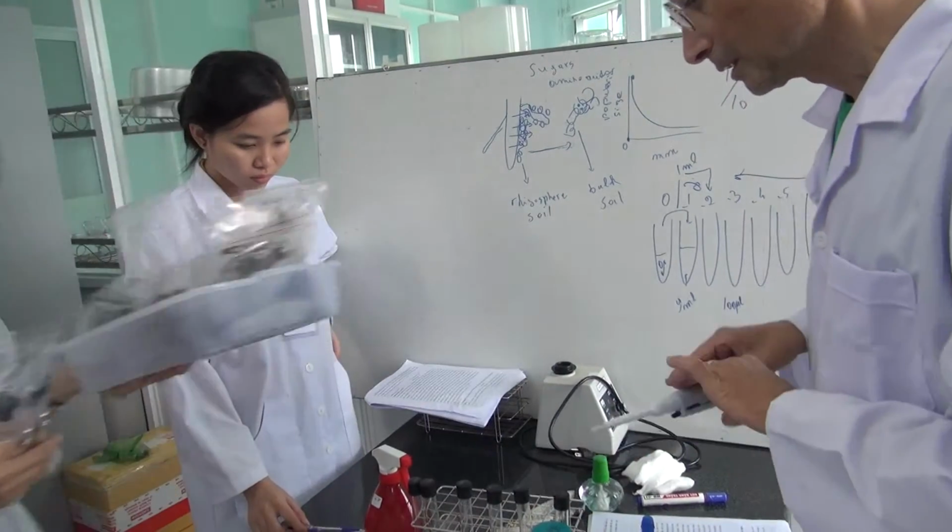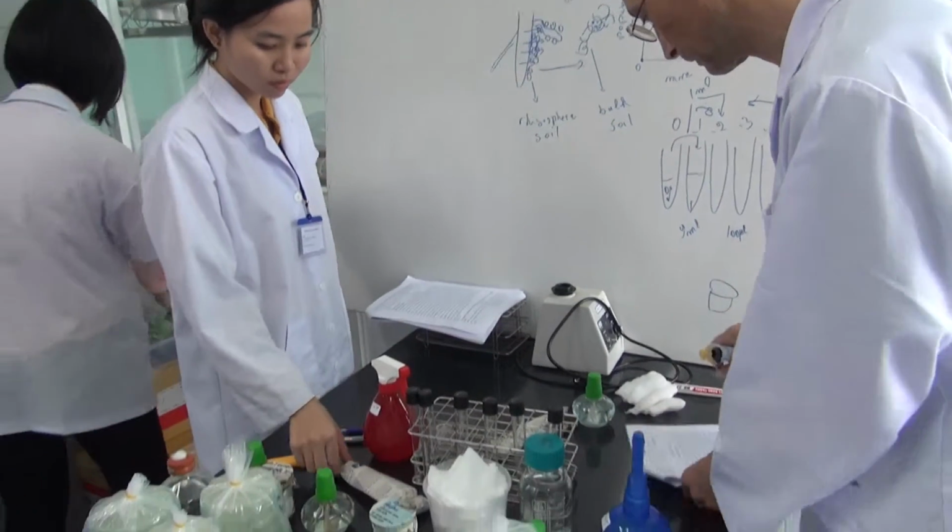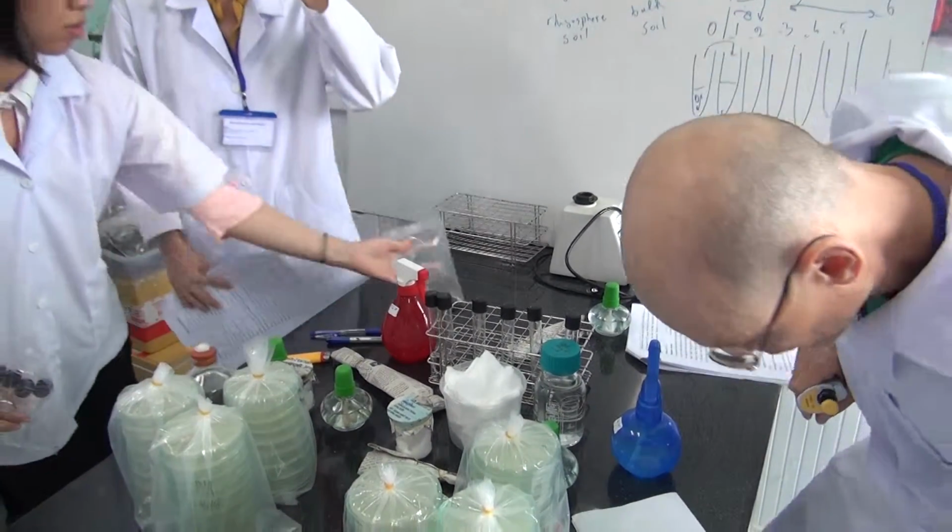Okay. So where are the? I would like to show how to do dilution.